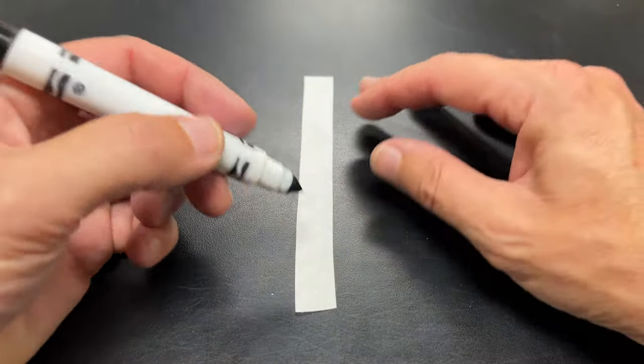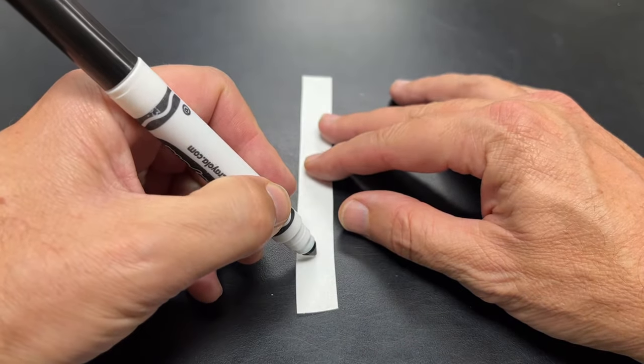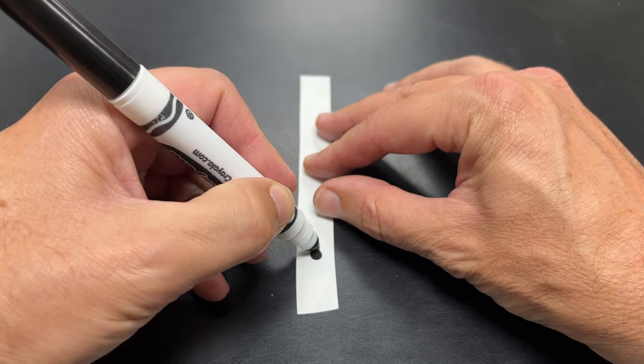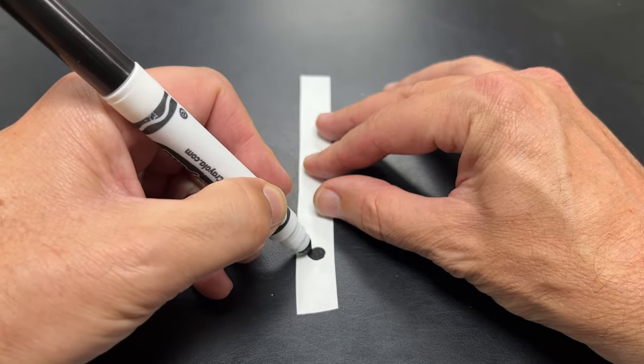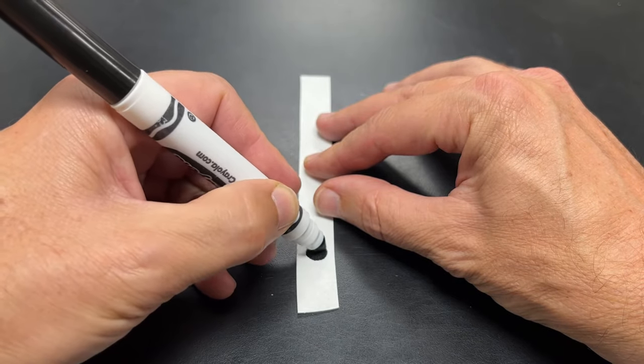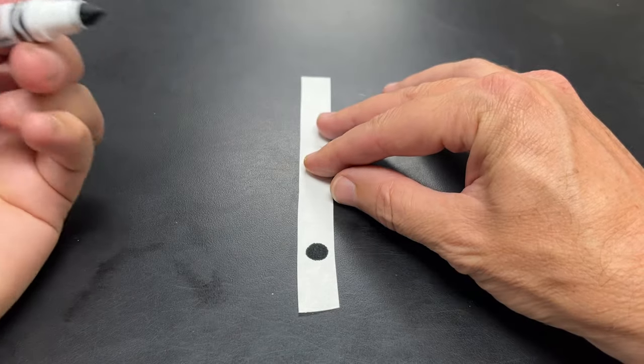I'm going to take the paper strip and make a black dot about an inch above the bottom. I'm going to make it really thick to really soak it into the paper. There, that's good.